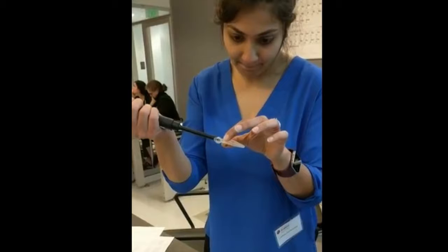All right, so here we have the pipette in the right hand and what is called the microcentrifuge tube. That tiny little tube is the microcentrifuge tube, okay? It contains 2 microliters of plasmid DNA and it has your initials on it.